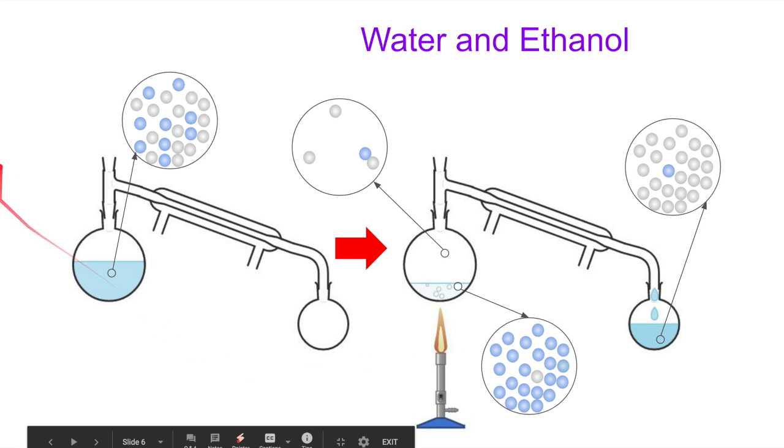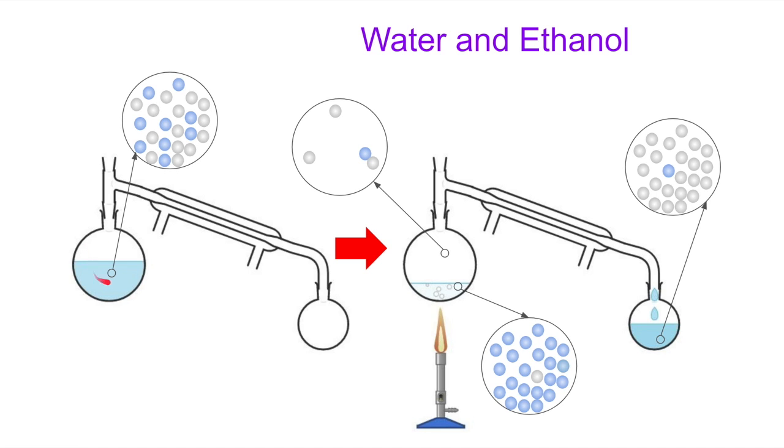This is what a distillation setup looks like. There's actually a before and after picture here. The distillation apparatus has got this container, it's just called a boiling flask. It's just a round flask that you can put some heat under to get it to start to undergo a phase change. It only has one opening, it's at the top, and that opening goes up to this tube, and you typically put either a stopper here, a cork, or you can shove in a thermometer or a temperature probe to tell what the temperature is.